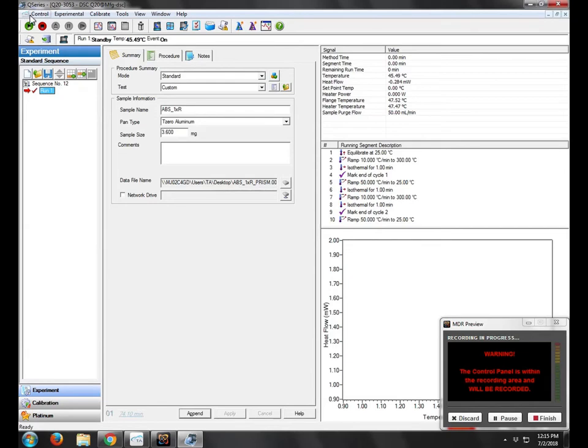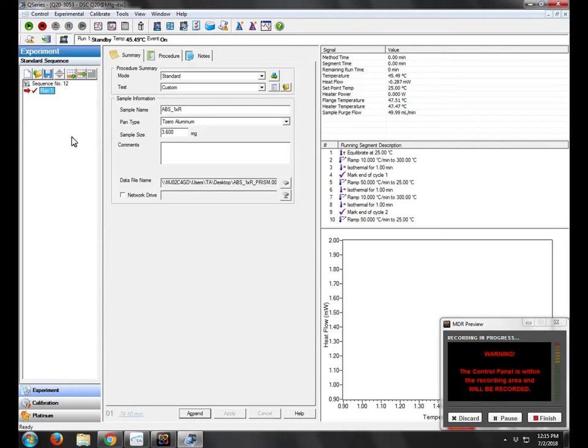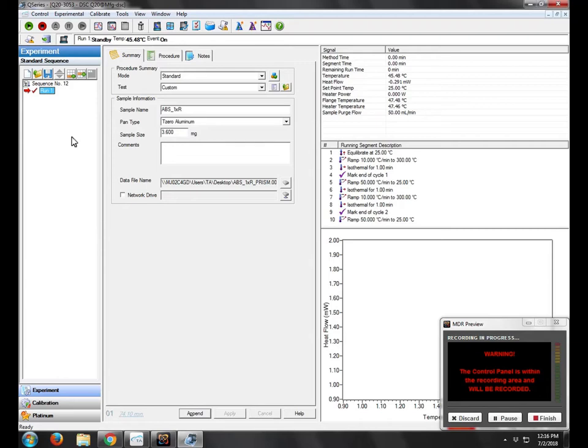We also want to do Control, Go to Standby Temp. This will make sure that the flange, that the cell actually doesn't go to a very cold temperature because we'll have a condensation issue inside the cell. So the flange will go to about minus 70, minus 80 degrees Celsius, but the chamber will not.